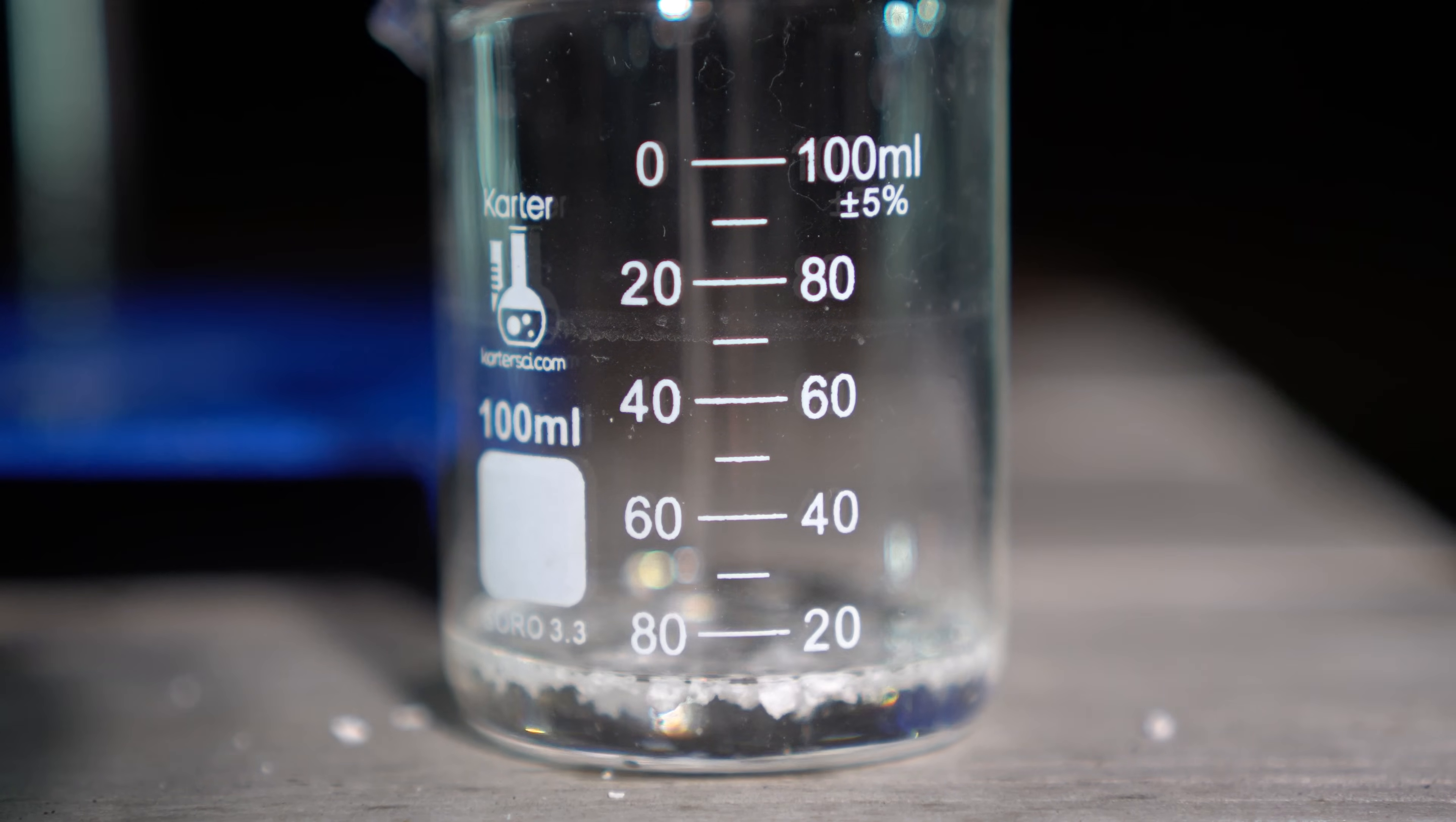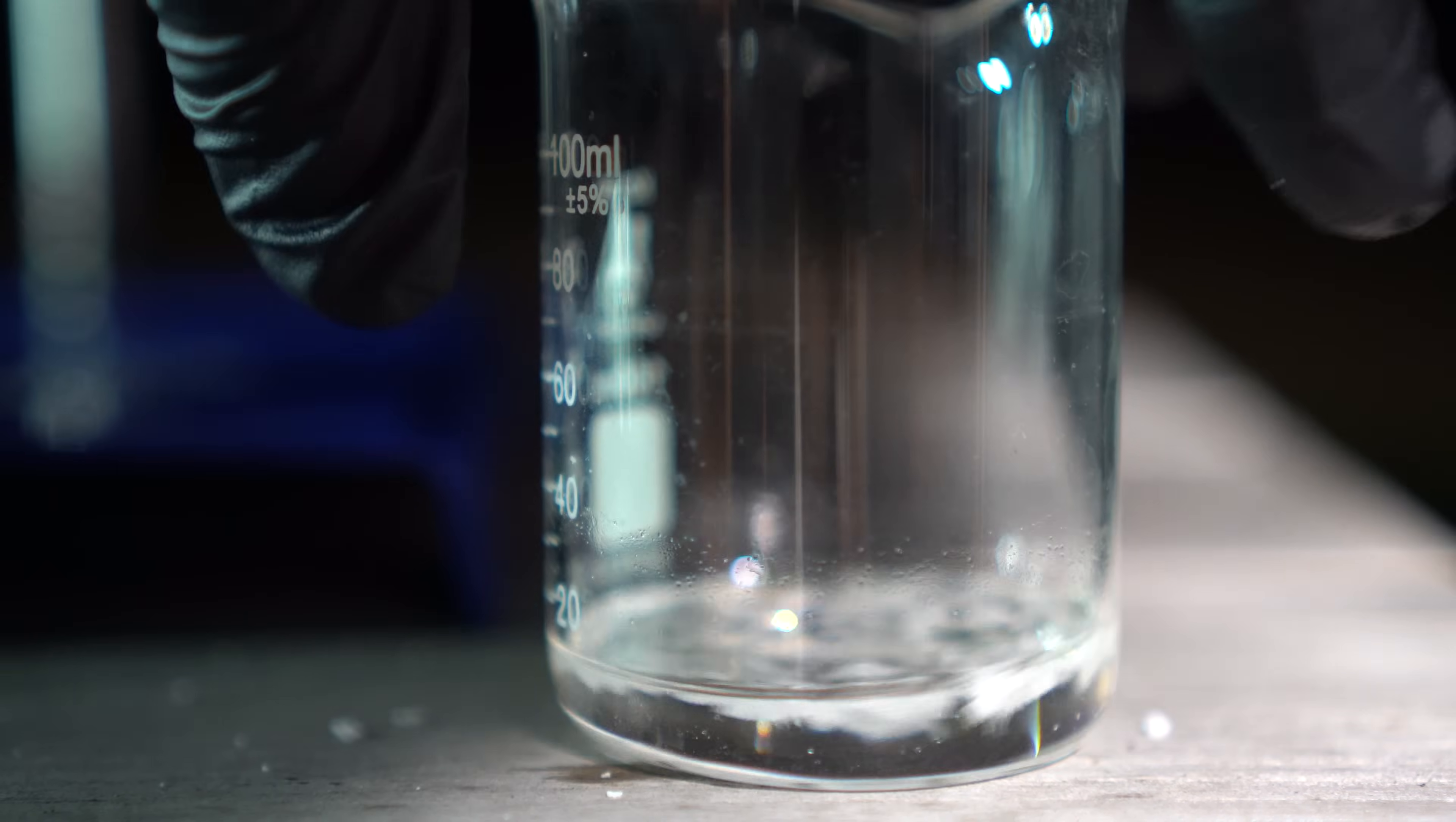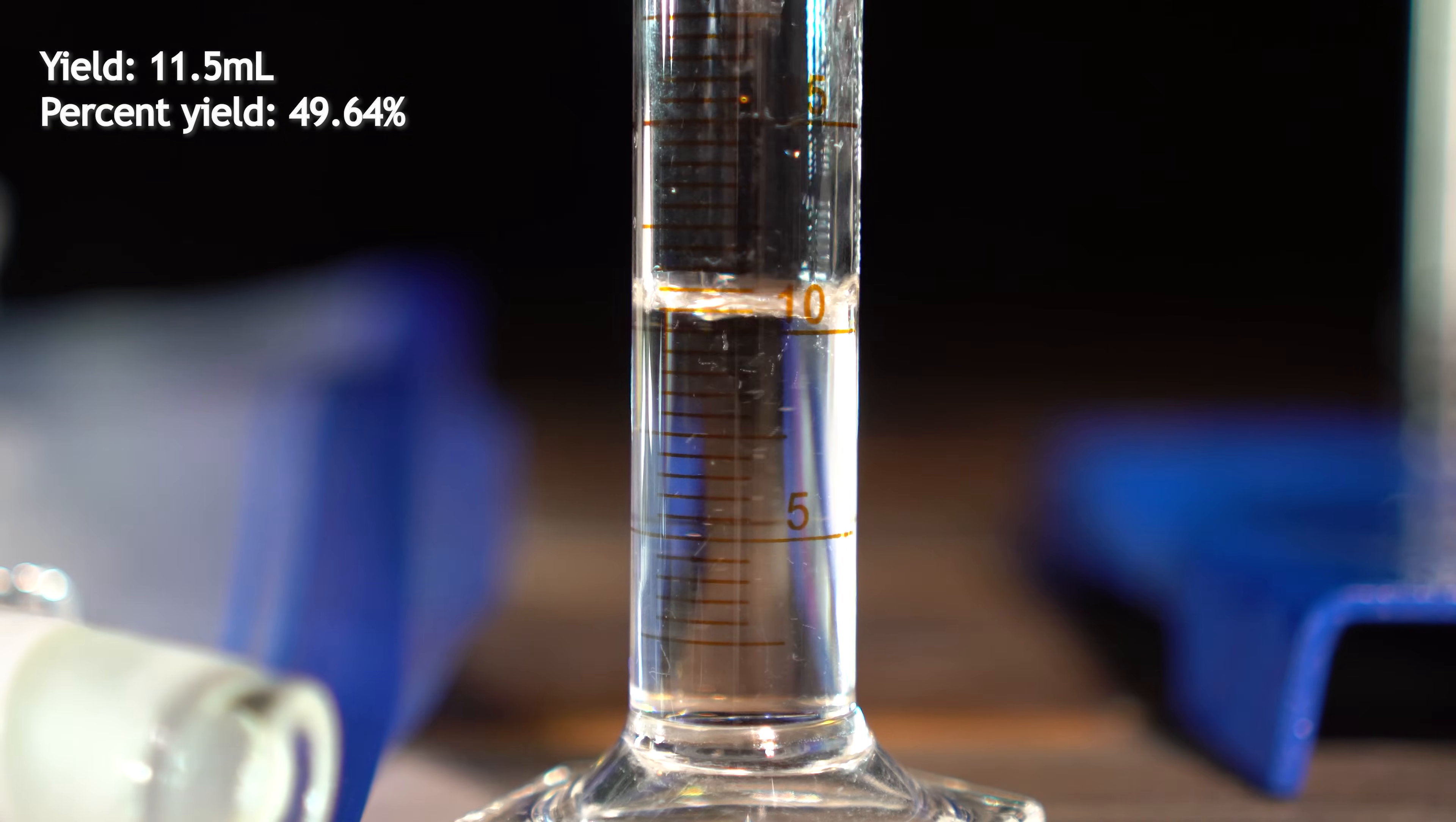All I needed to do now was dry the iodomethane with some calcium chloride. This should dry up any of our product from any extra water. Roughly 11.5 milliliters of iodomethane was obtained, resulting at a 49.64% yield.